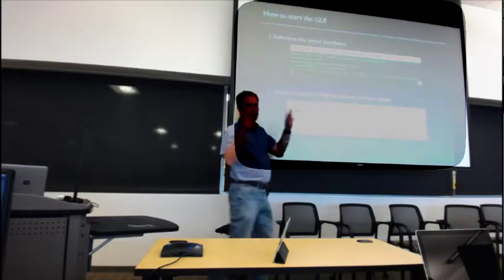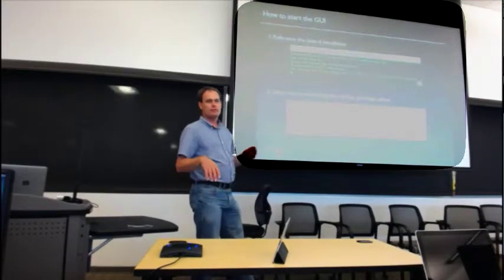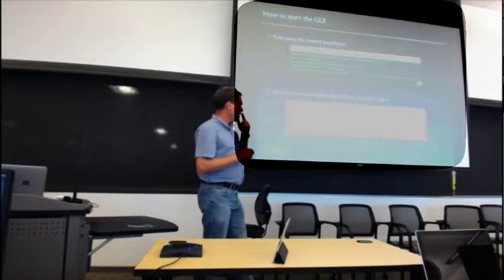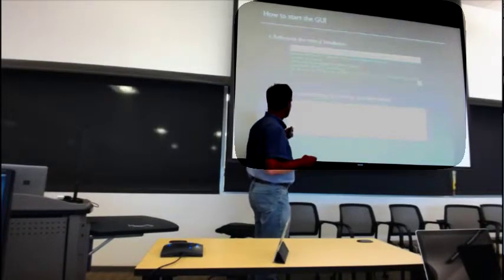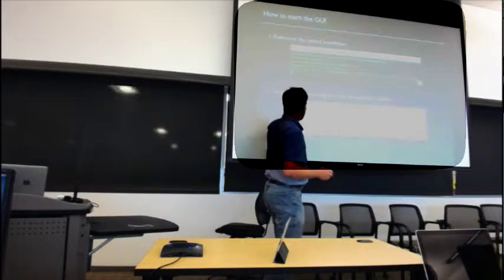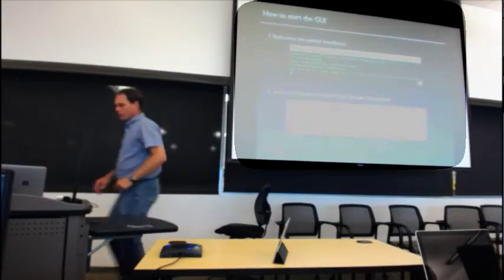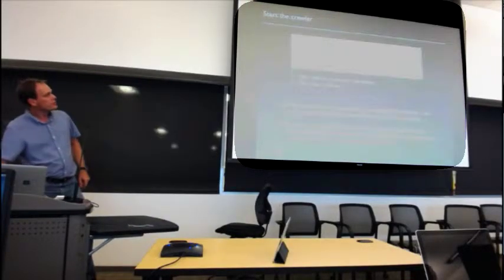It launches into a programming environment that I learned ages ago. Not even Python. It was originally written for the PDP-11. So it's a bit text-based, but it works. And it pulls up a little thing. Find the experiment. You go and navigate to your experiment, open up the crawler file, and you should come up with a GUI.